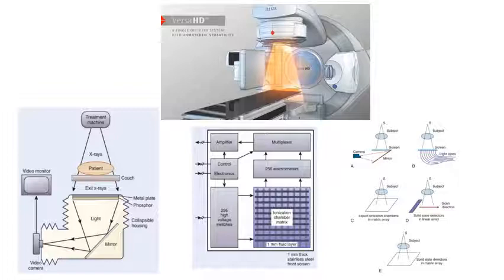On the bottom left is a fluorescent screen and video camera system, which was housed in a light-proof, bellows-mounted chamber. The system suffered from noise due to the stray light and poor detector efficiency, which is a combination of both the screen and camera. Efforts were made to improve this using fiber optic pipes, as shown on the bottom right, but these systems were nevertheless replaced with more efficient systems.